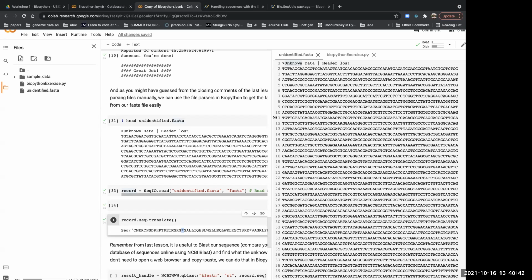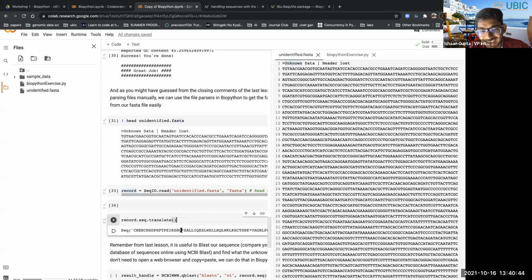Stop codon. There we go. Yeah, so that is the stop codon actually. You can probably check here. You are free to check the sequence and find the first stop codon, but that is very much the stop codon basically. All right, let's look at the ID again.